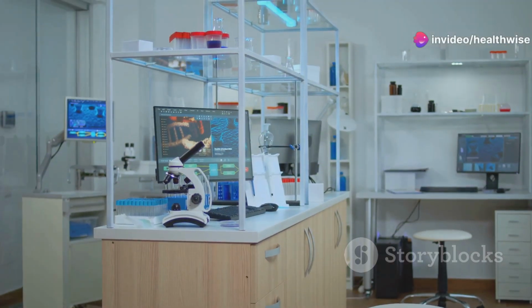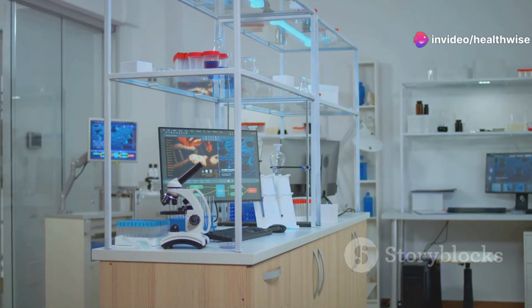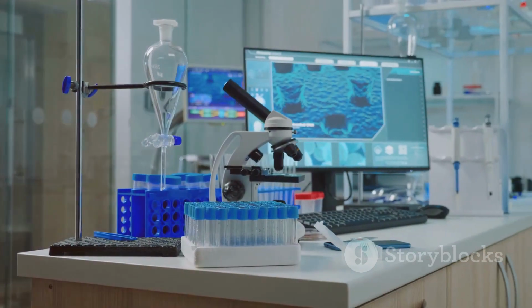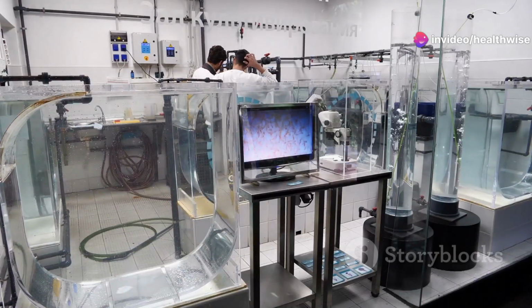Cell culture incubators are specialized devices that provide the ideal conditions for growing and maintaining cell cultures. They often have advanced features like HEPA filters to ensure a sterile environment. These incubators are crucial for medical research and biotechnology applications.